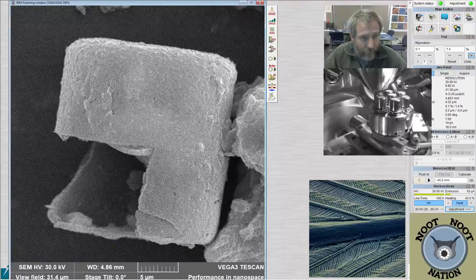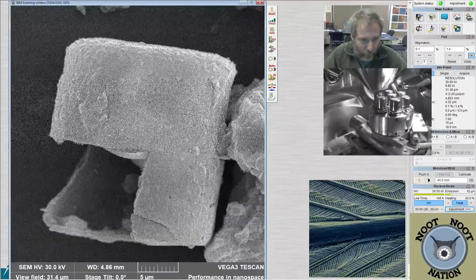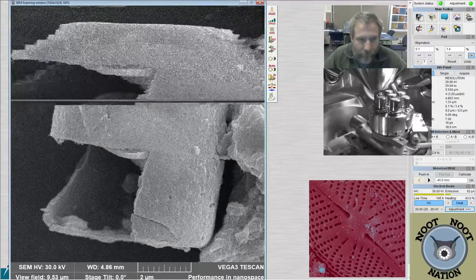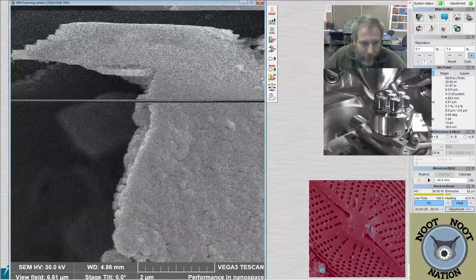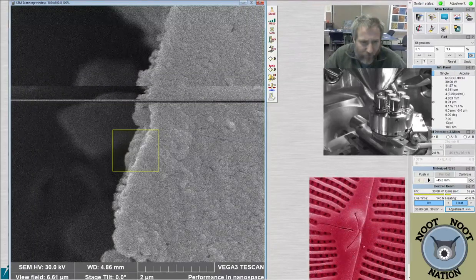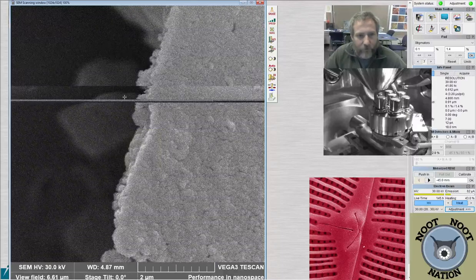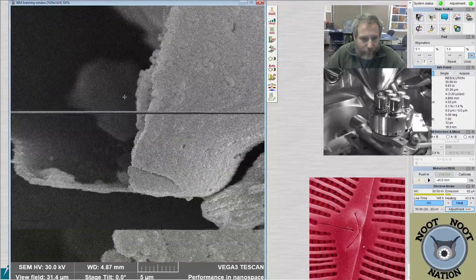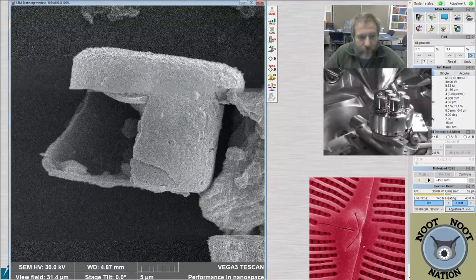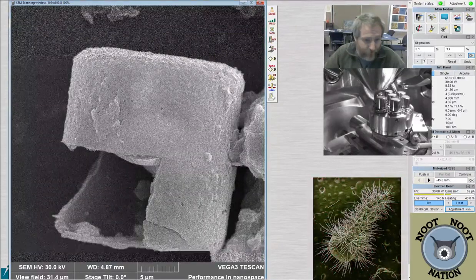from the side. So you can see both valves, and one of them's been broken open, so you can see inside of the valve, which is kind of nice. And here you can actually see the structure on the valve edge right here a little bit of that diatom. Also, it's a good confirmation for me that we were actually looking at Melocyra.